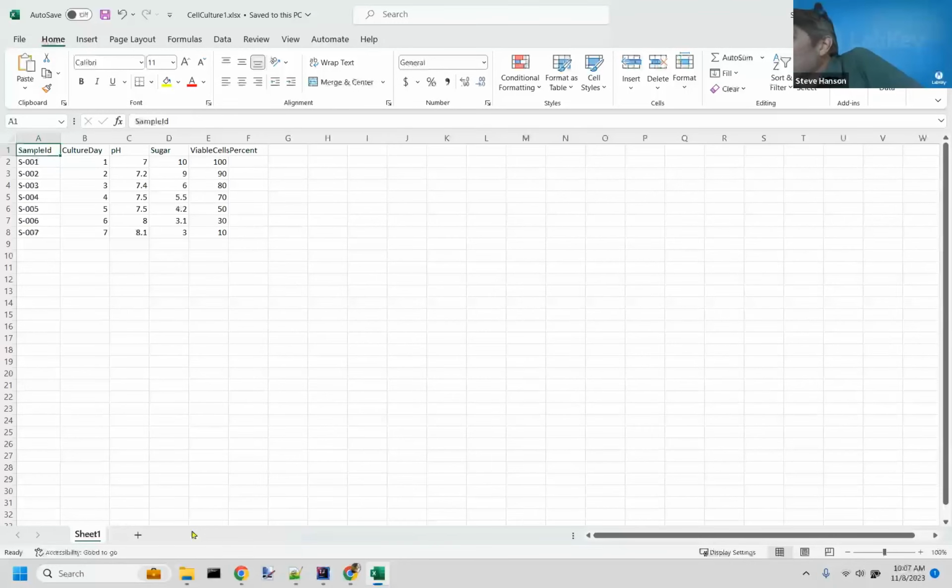I have one more question here. Could it be possible to upload data from different databases into LabKey instead of Excel? If yes, do we need to add some connectivity code? The answer to that is yes. LabKey has a way to capture pre-existing database data. It's called an external database, or external data source.